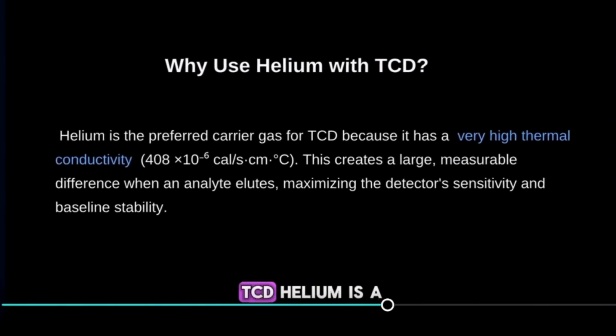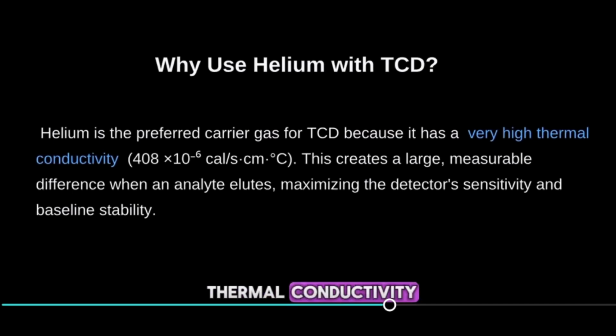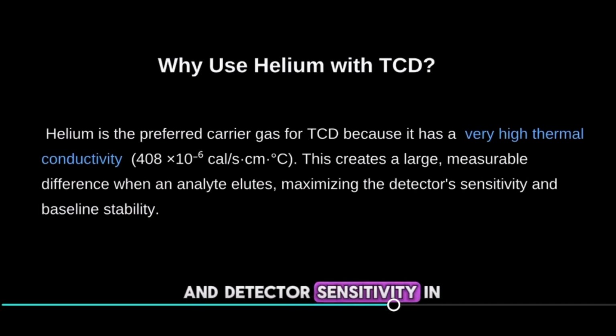Why use helium with TCD? Helium is a favorite carrier gas because of its high thermal conductivity. This makes even small analyte changes easily detectable. It enhances baseline stability and detector sensitivity. In TCD systems, helium keeps every signal crisp and clear.